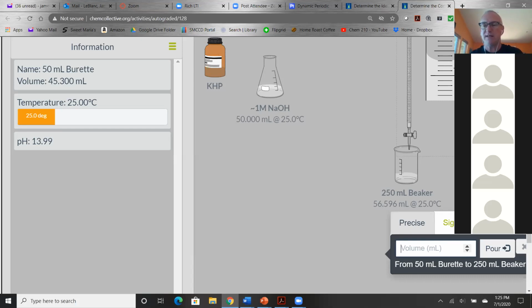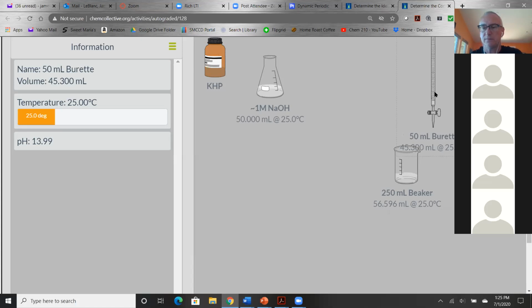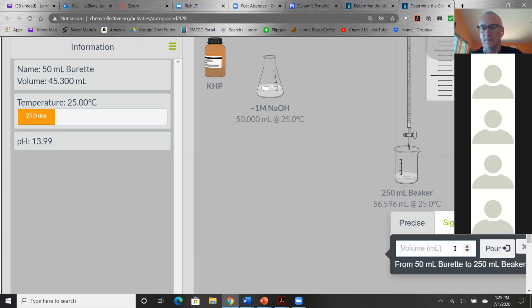That's why I'm using these really small volumes. So I'm going to go back to 0.05. So I'm going to keep going. Here's my beaker. With me, mine turned pink like 3 clicks before it started to turn pink. Huh? It started to turn pink before it turned pink? I don't understand. No, sorry, I meant it turned pink once it hit a pH of 10.7. Yeah, okay.